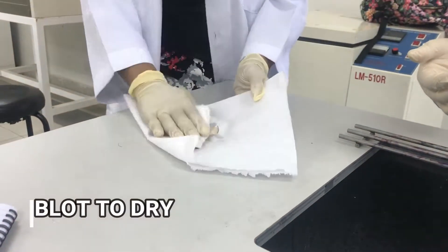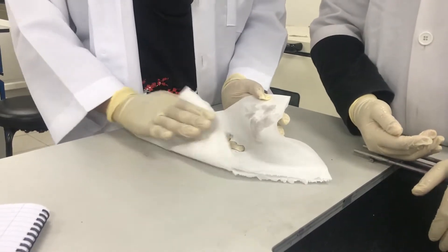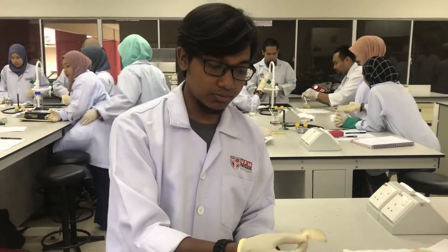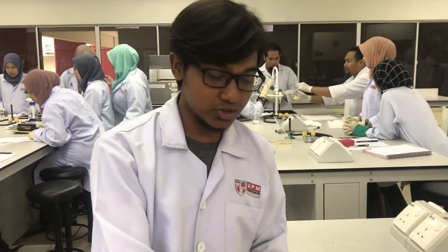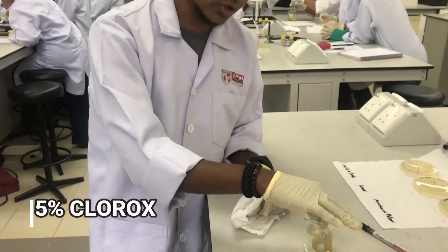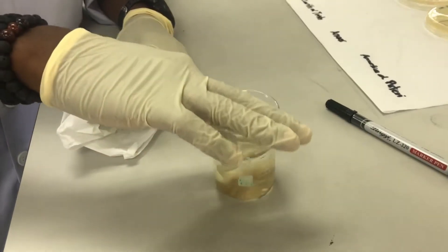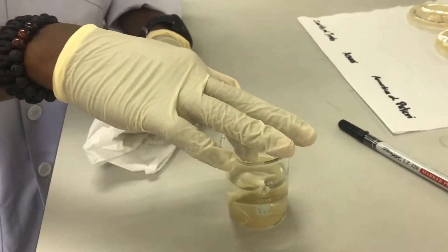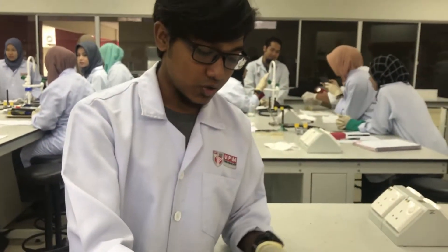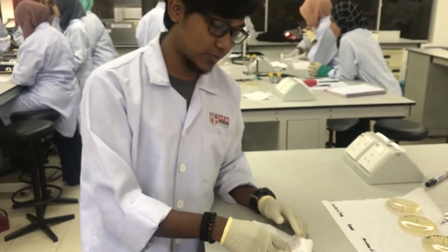After we blot dry the grey oyster mushroom, we need to dip it into 5% of the chlorine solution for a few minutes. And then after we dip it into the 5% chlorine solution, we need to blot it dry to remove the excess of the 5% chlorine solution.